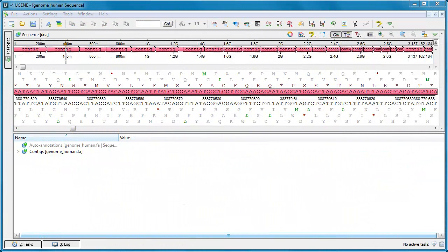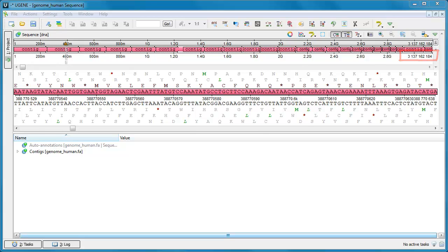The Sequence view is now able to visualize very long sequences, even on slow hardware. For example, as you can see, the sequence of the human genome is now opened, which is 3 billion base pairs in length.